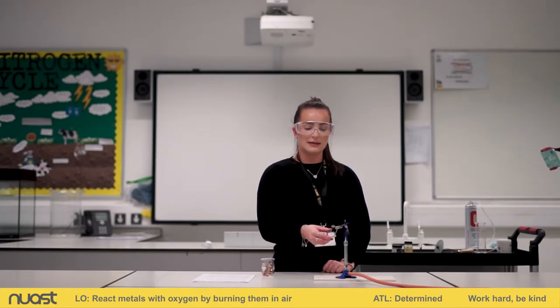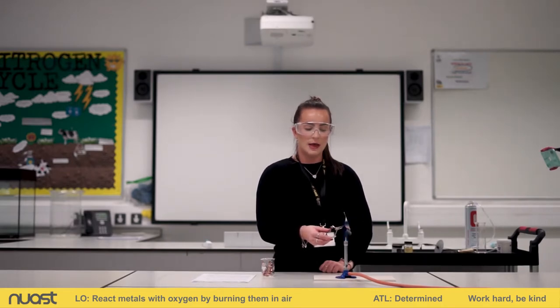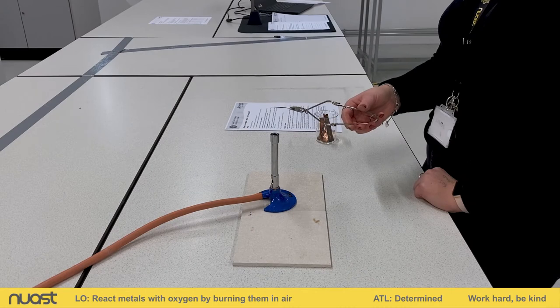So I'm obviously reacting oxygen, which is in the air. This room is full of oxygen, okay? Air, remember, is a mixture of lots of different gases, oxygen being one of them. Okay, so this copper is reacting with the oxygen in the air. And have a think about what that product's going to be called.